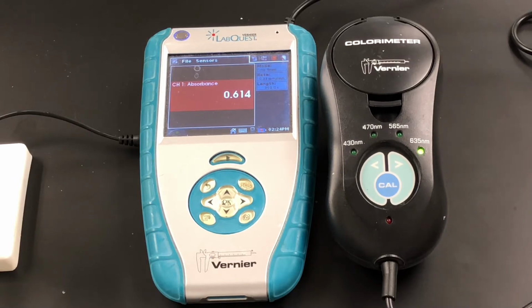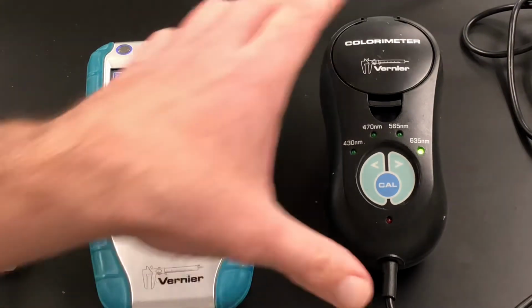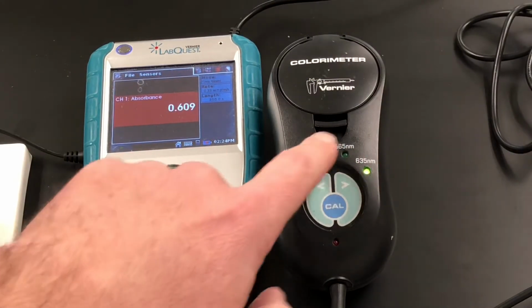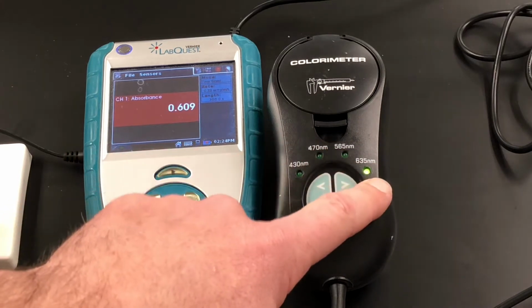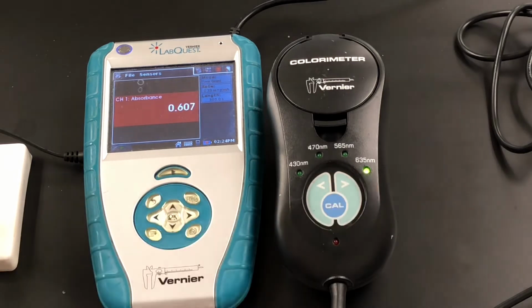In order to determine the concentration, we're using Beer's Law, and in order to use Beer's Law, we're going to need to take some absorbances. So we have the Vernier and we have a colorimeter. You'll notice that the colorimeter is not as diverse as a spectrophotometer. We only have 4 wavelengths available to us, and the wavelength chosen is 635. That's where we're going to get some of our highest absorbances for this particular chemical.